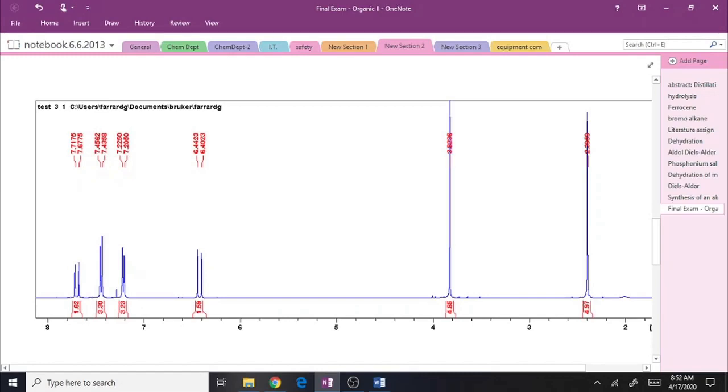So let's look at NMR spectroscopy. This is a proton NMR. You should recognize the various regions in the spectrum. For example, between about 3 to 4.5, this is the alkoxy region, meaning that this is an OCH of some sort. Typically around 2.7, this is the region where we find benzylic and allylic.